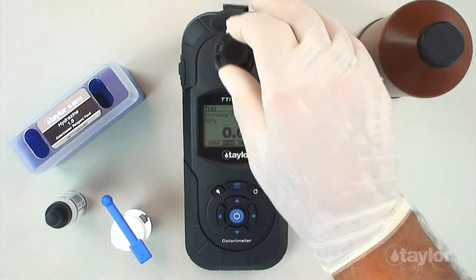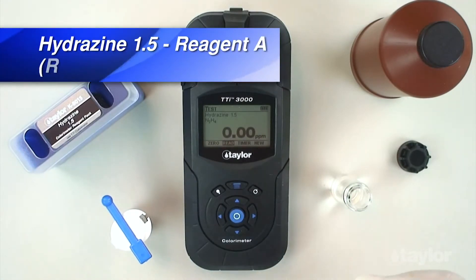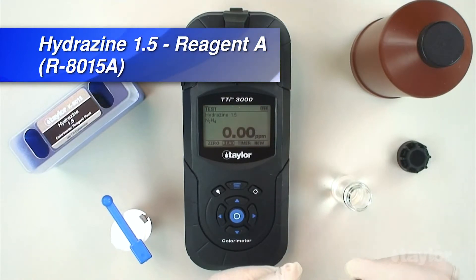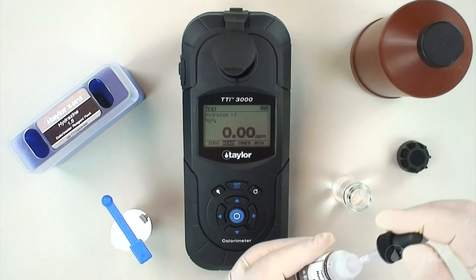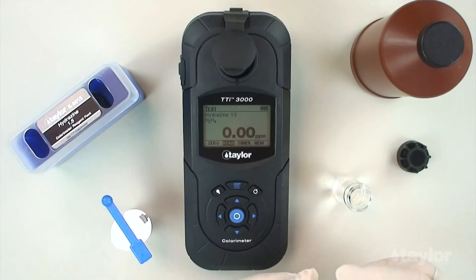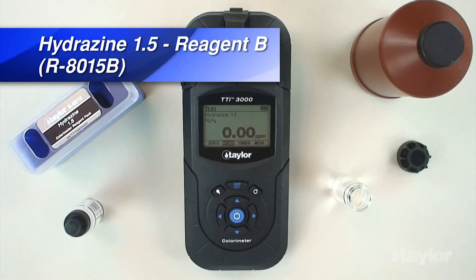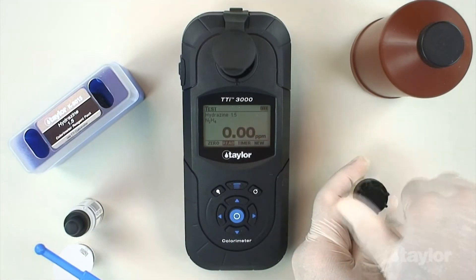Remove the sample cell from the sample cell compartment and remove the cap. Add 4 ml hydrazine 1.5 reagent A, and then immediately add 1 level dipper hydrazine 1.5 reagent B. Cap and shake for 10 seconds.